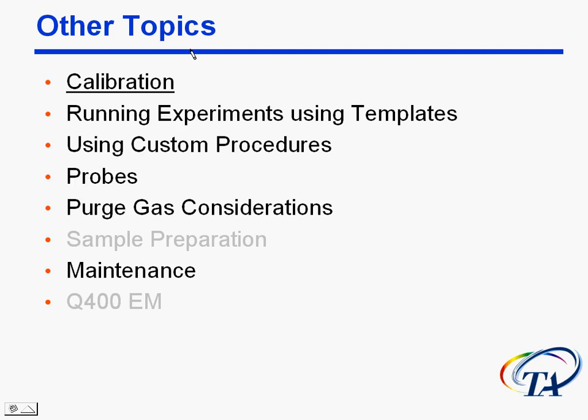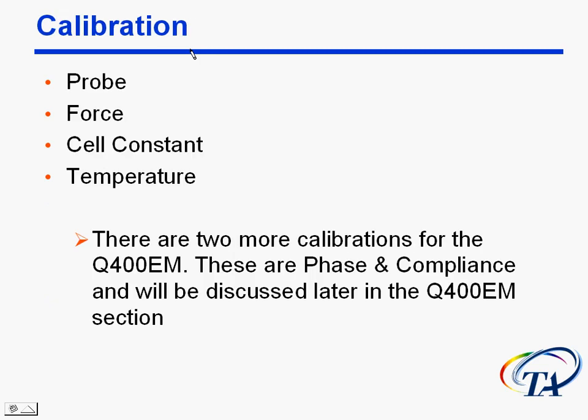All right, calibration. These are the different calibrations that we need to worry about: probe calibration, force calibration, cell constant, and temperature. And there are a couple of other calibrations that we'll talk about in the EM section, phase and compliance.